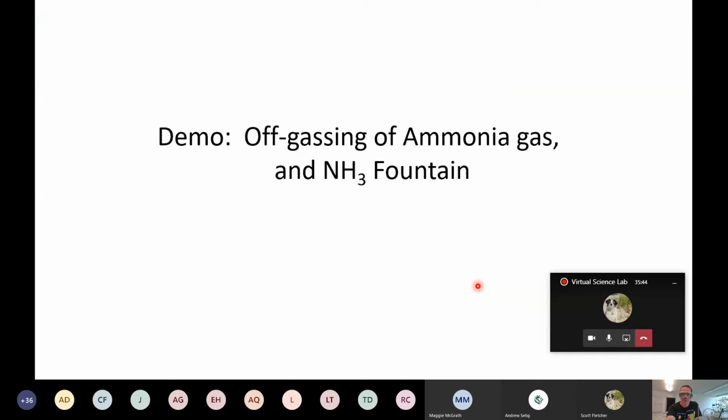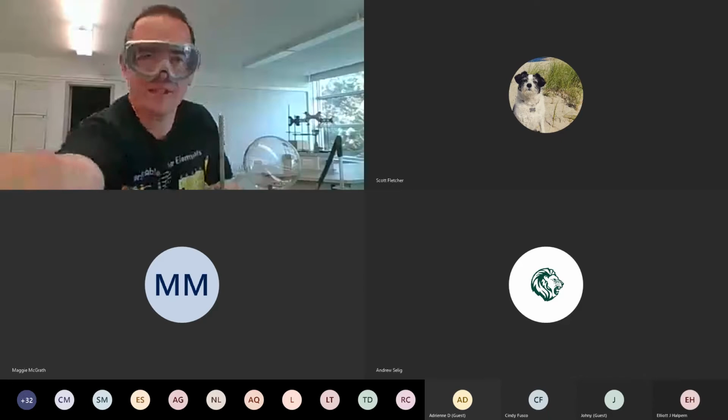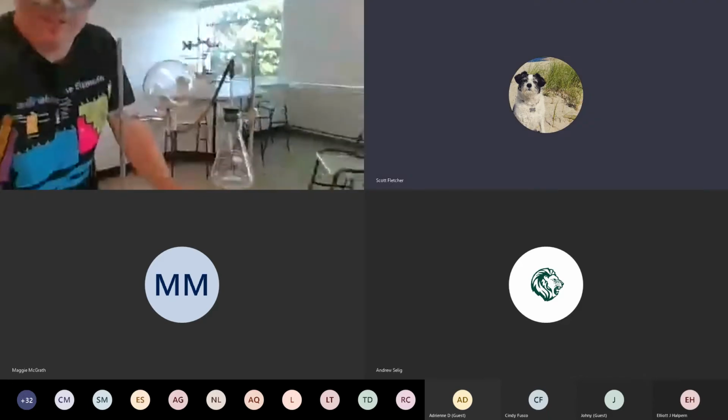Okay, so here we go. Our next demonstration is the off-gassing of ammonia gas and the ammonia fountain. So we'll go ahead and stop presenting here. Yeah, you're back in your lab.